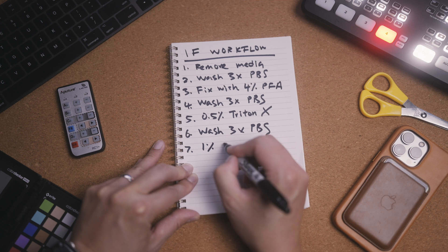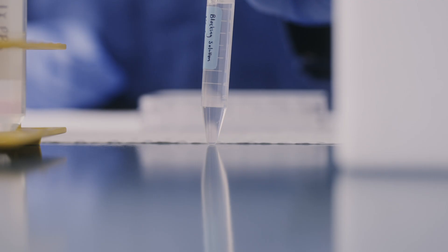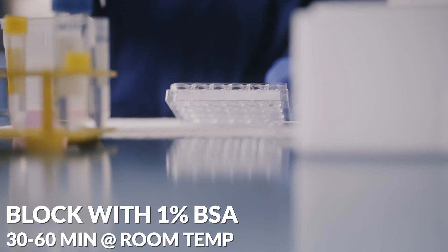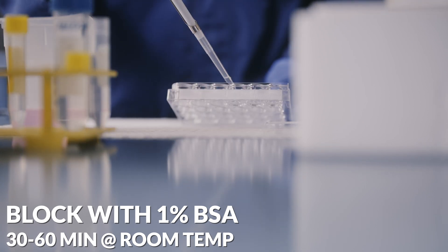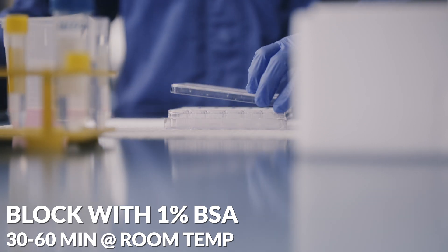The final step before we add antibodies is to add blocking solution onto the cells. This prevents any non-specific binding between antibodies and non-target structures, as the blocking solution is flooded with other proteins. You can make this blocking solution up with 1% bovine serum albumin, BSA, or serum. From this step onwards we'll be adding antibodies, so everything is diluted and washed with blocking solution to minimize non-specific binding at each step. Leave the blocking solution on the cells at room temperature for 30 to 60 minutes.